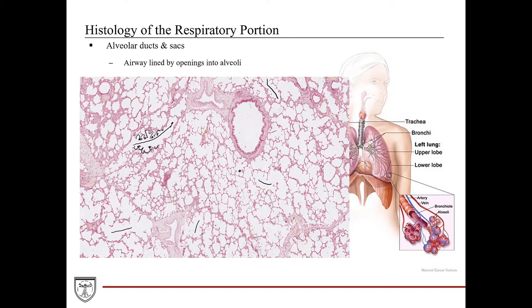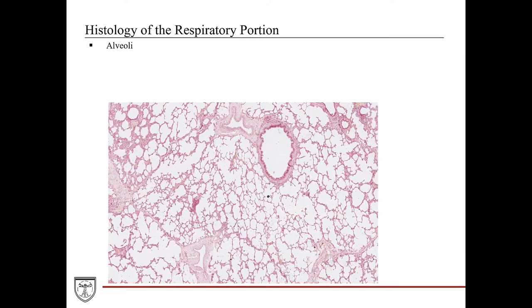Alveolar sacks are found at the end of the alveolar duct, where there's a common chamber ending in a series of alveoli. Gas exchange is occurring throughout these pathways. Now we've arrived at the alveoli — spherical, air-filled sacks where gas exchange occurs between the air and blood within the capillaries. Despite being the smallest branches of the respiratory tree, the alveoli form the parenchyma of the respiratory system. When we add up all the surface area of the alveolar lining epithelium, the alveoli make up by far the greatest surface area — which is ideal for gas exchange.